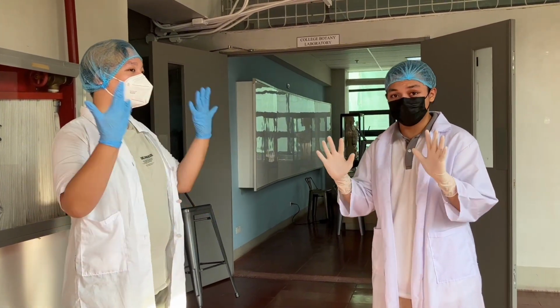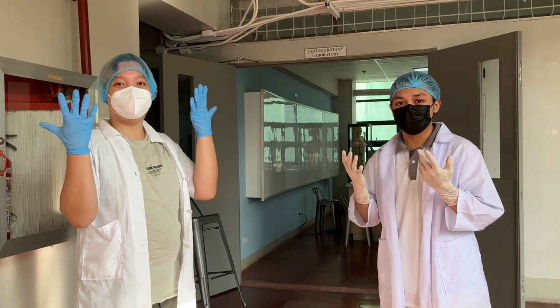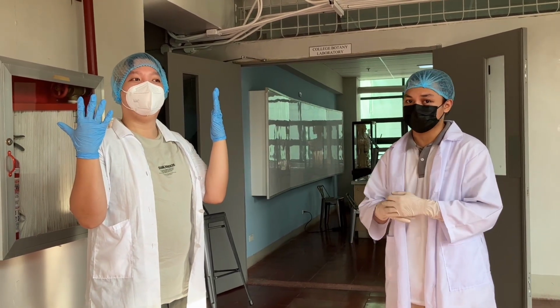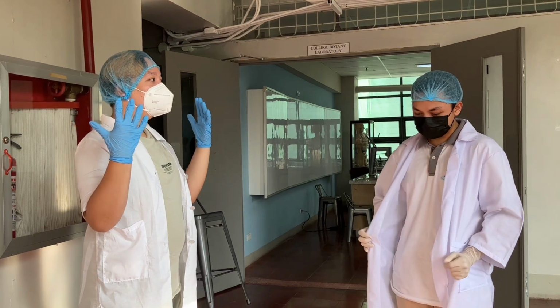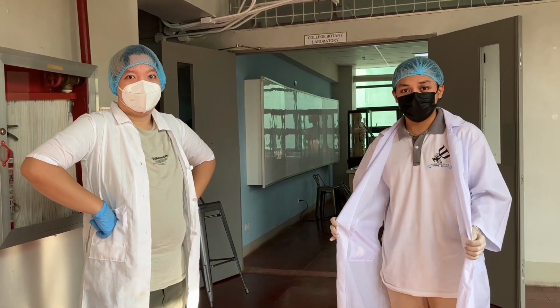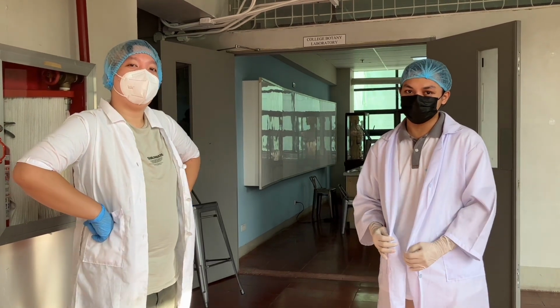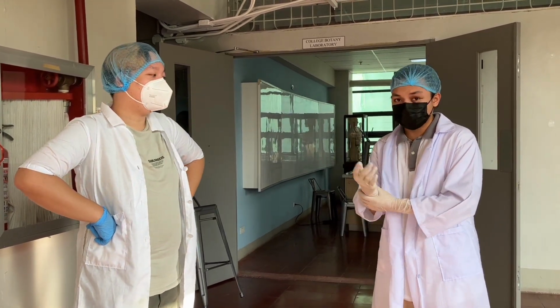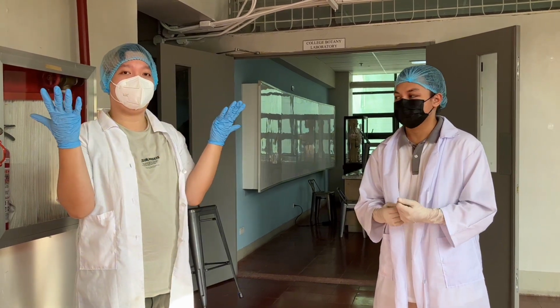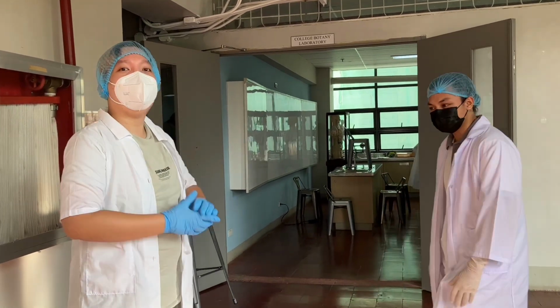Then, our gloves, for our hands to not have direct contact with our chemicals that we will be using inside the laboratory. And next, of course, we need to ensure that we are not wearing any accessories. That's right. Watches, eyeglasses, necklaces, or any bands that we use. So, tara na. Yes, tara na.